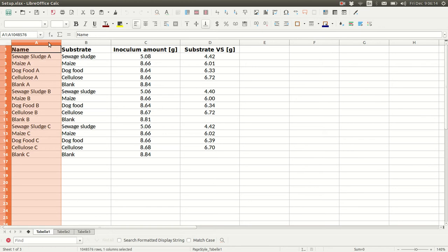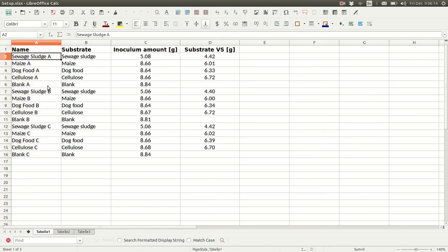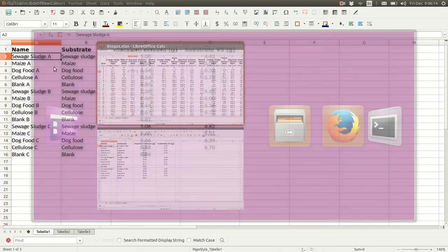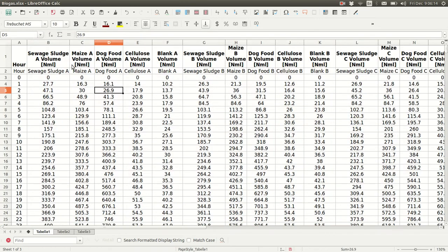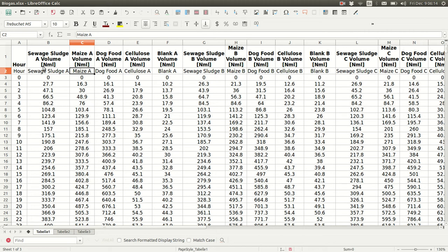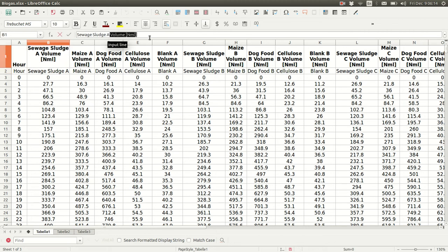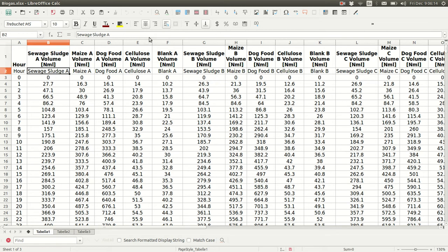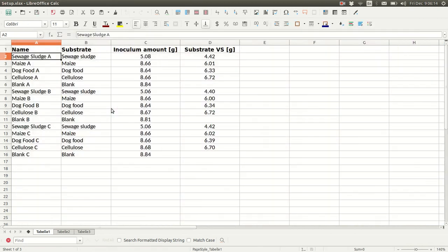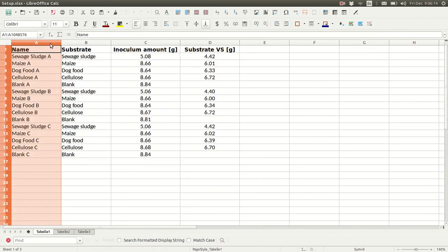These four columns have name. The values in this column need to exactly match the column names in the biogas file. Because of this, I've made a new header row without volume and then units for this file. But I've kept the original header row so that we have a record of the units.